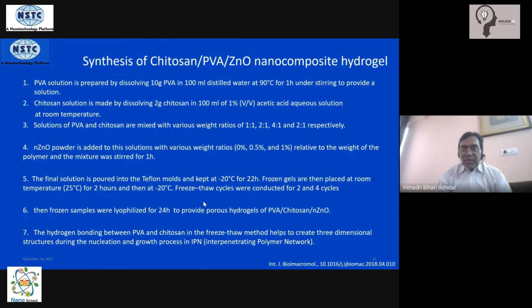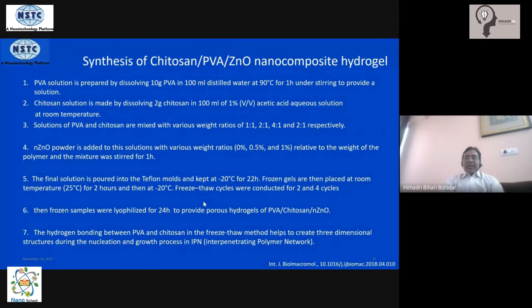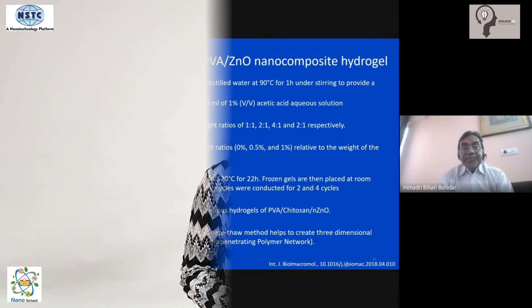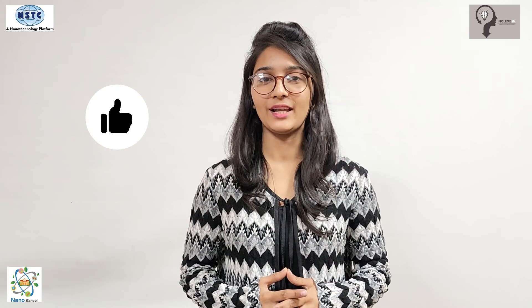Then we form this PVA-chitosan network structure, which is a gel, with ZnO already entrapped inside it. Ultimately, the frozen samples are lyophilized for 24 hours, and then you get a porous hydrogel of PVA-chitosan-zinc oxide nanocomposite.